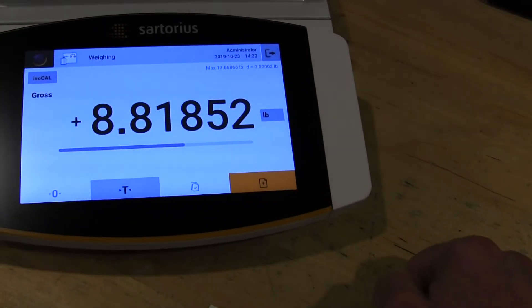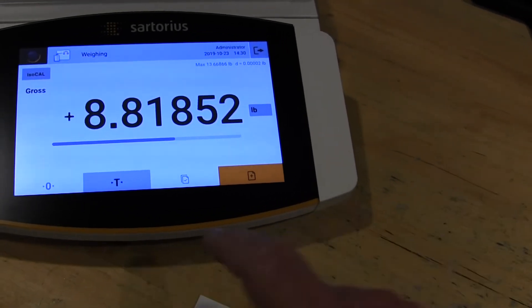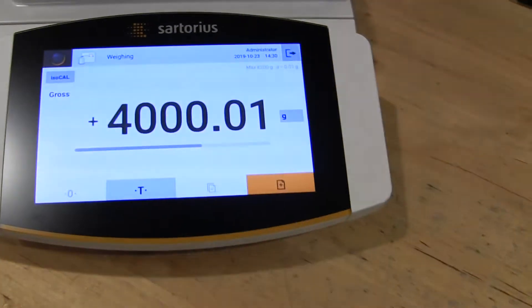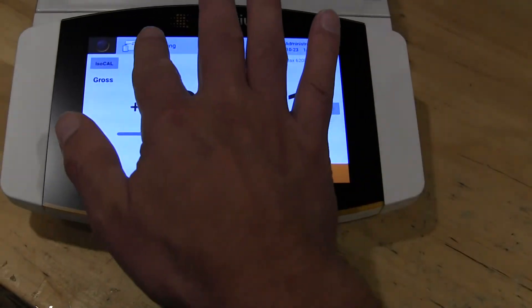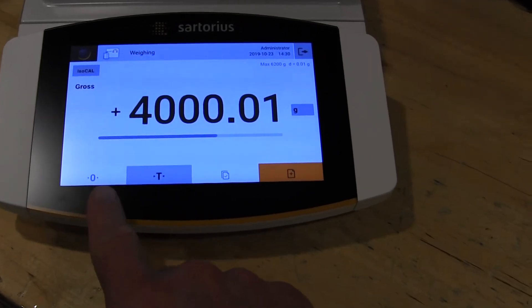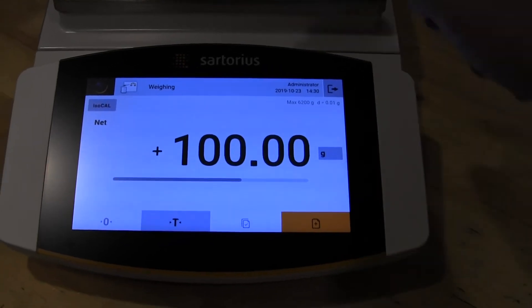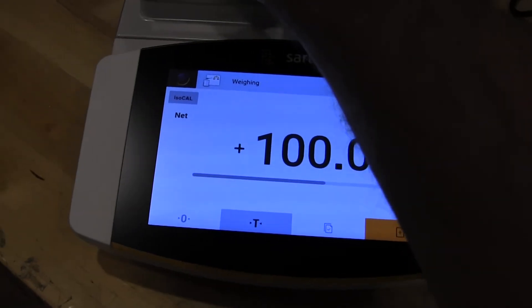Unlike other Sartorius balances like the old CPA series where you had to go through keypads, this is all touch screen and it's very simple. You have a nice nav bar at the top, you're in the weigh-in mode, logged in as administrator, and there's your tare button — so you can tare out your four kilograms if you wanted to. Put on a hundred gram weight and it's very fast.